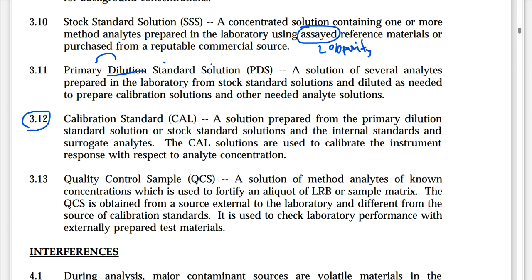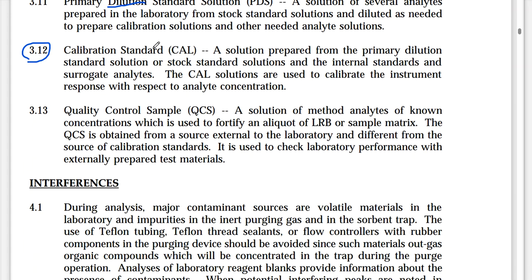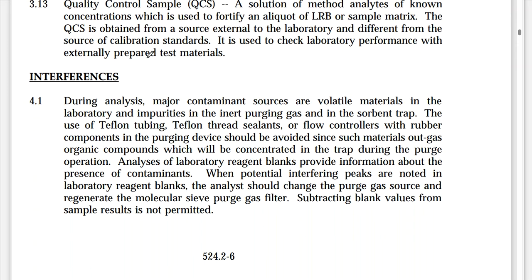So from here on out, we're just going to do a very brief introduction with each one of these sections that we're going to see in a proper method, or that we could see in a proper method, talk about why they're there, talk about what the purpose of them is. And the first one that we're going to talk about in this video is going to be this section called interferences.